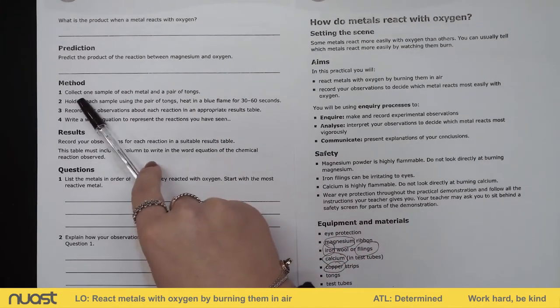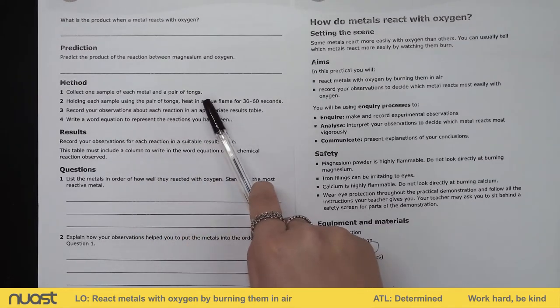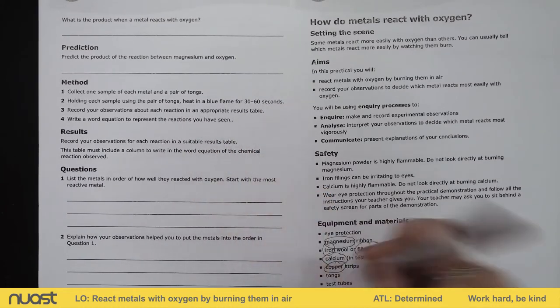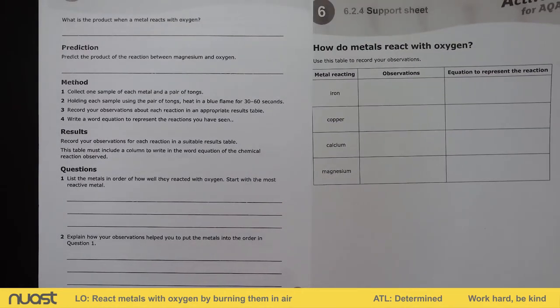If we have a look through our method, we're going to collect one sample of each metal and a pair of tongs. We're going to heat each sample using the pair of tongs in a blue flame using our Bunsen burner for 30 to 60 seconds, and we're going to record what we see, our observations, in our table.